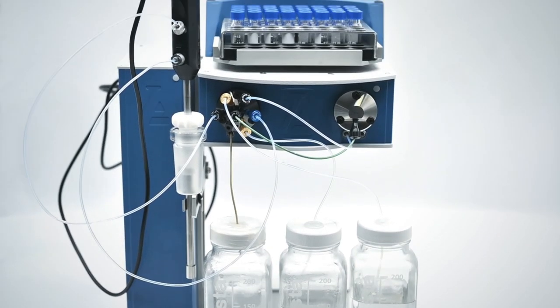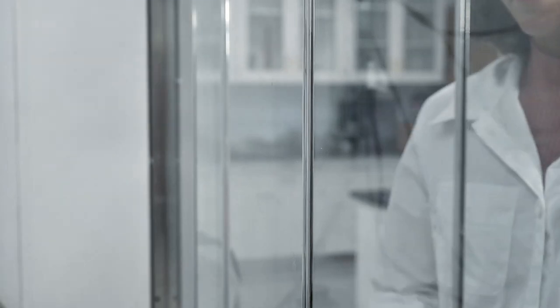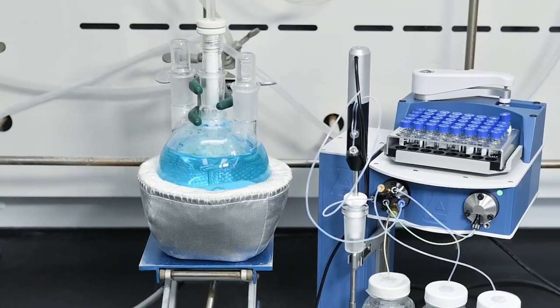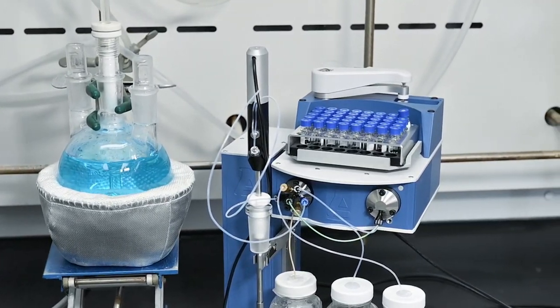Liquid sampling is essential in many laboratory and industrial applications. Introducing Samplify, an automated sampling solution.